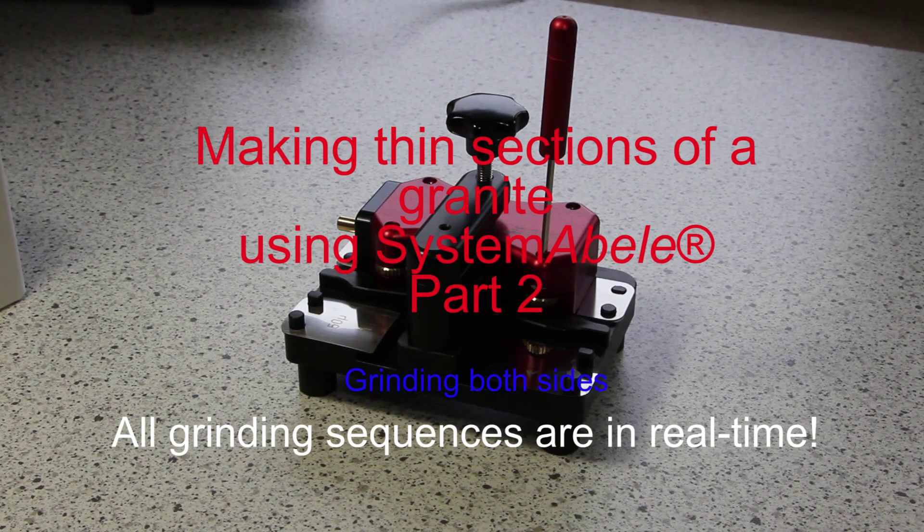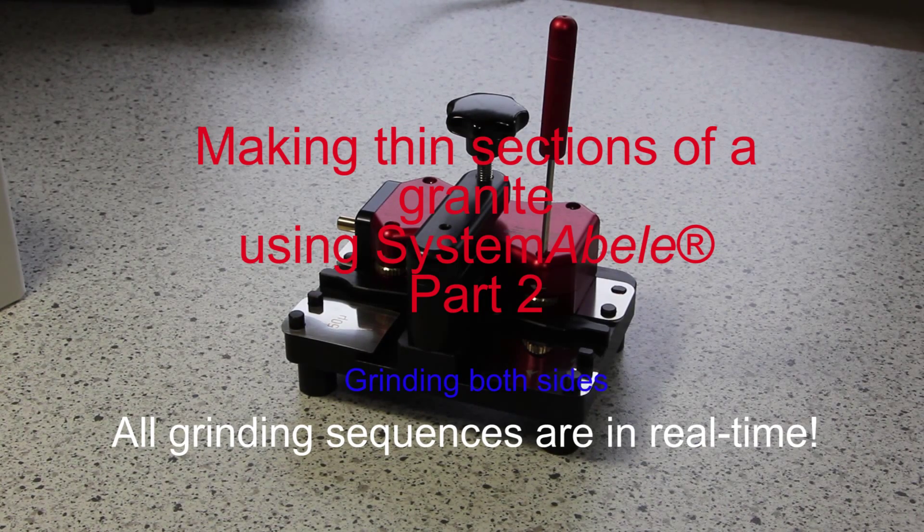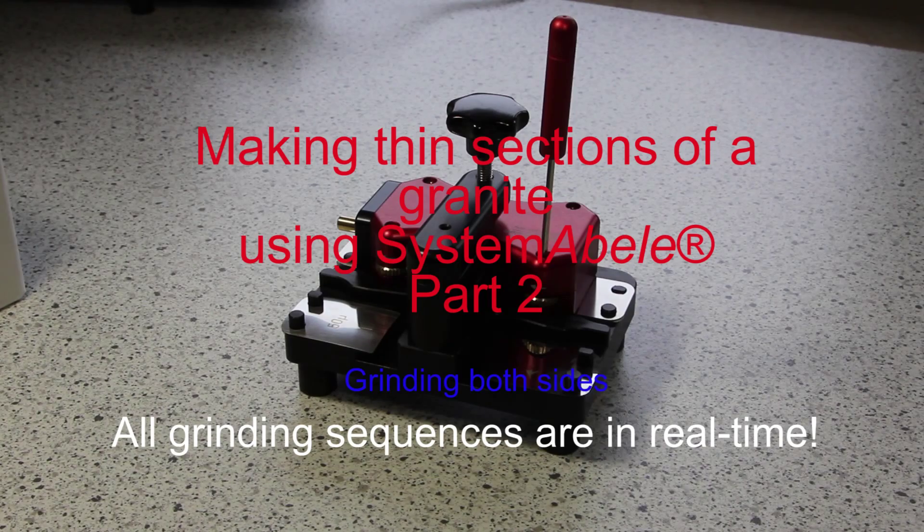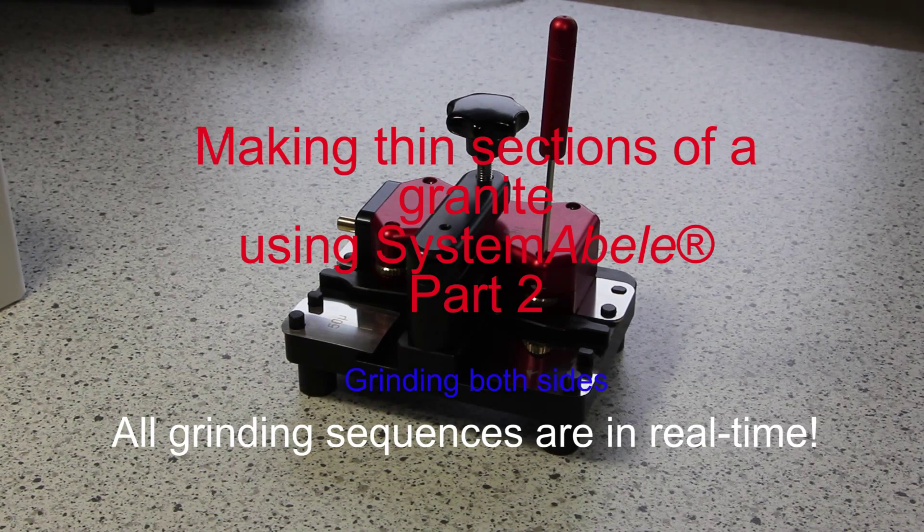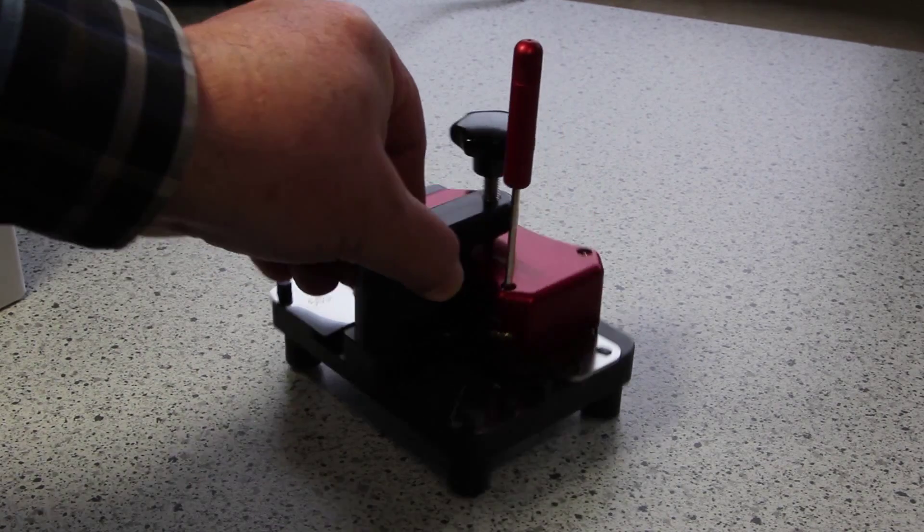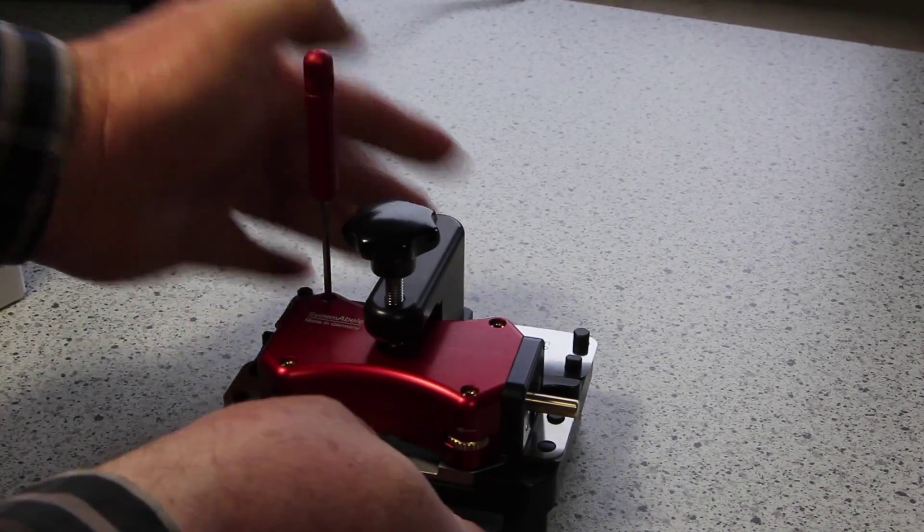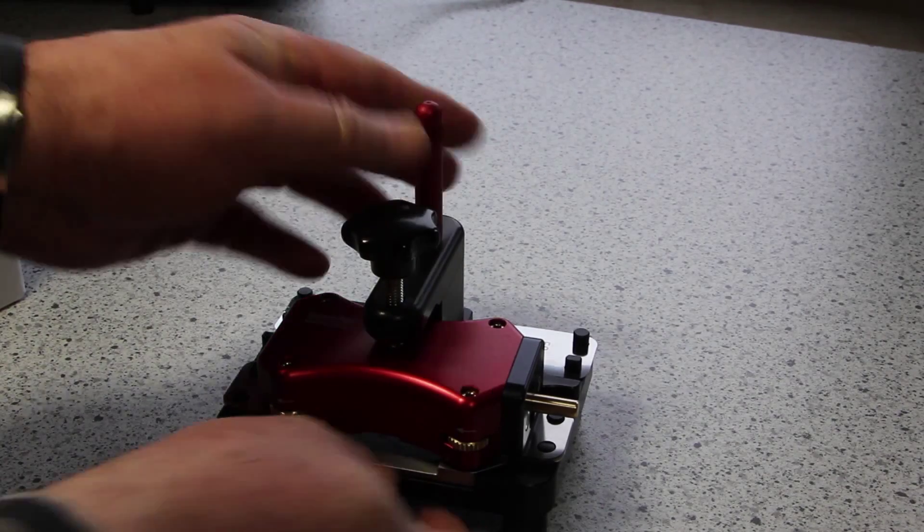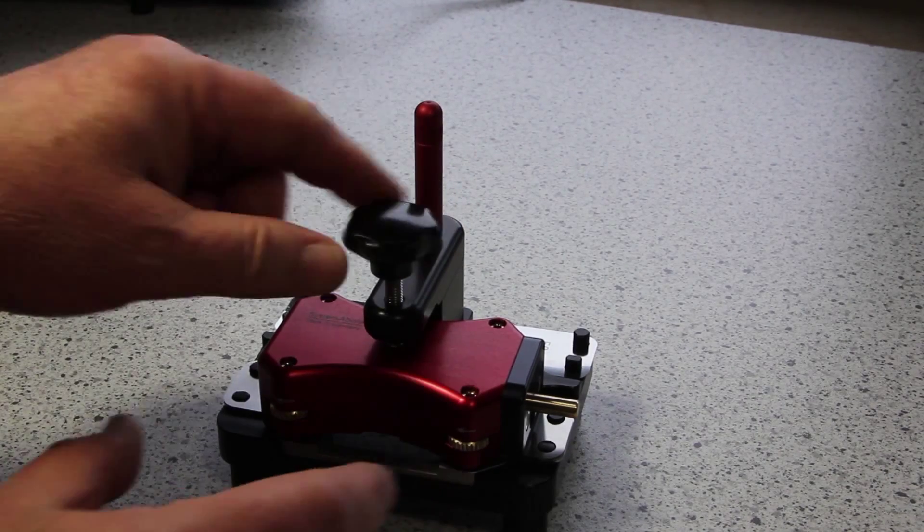This is part two of making a thin section of a granite. I've adjusted the mount before, now I turn the setting device around again and I take out the mount.